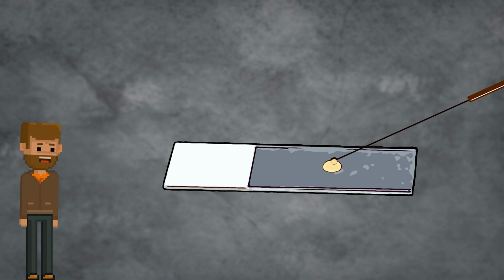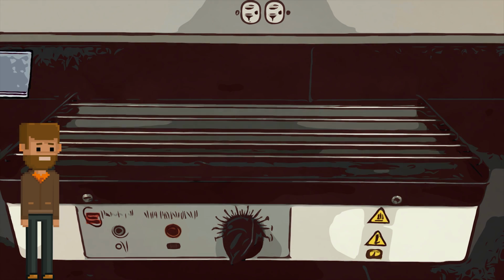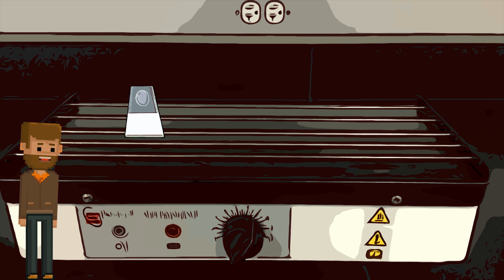It might take a little practice, but you don't want to put a huge glob of bacteria, and you also want to avoid not putting enough bacteria. Once you've transferred the bacteria onto the slide, you'll want to try and spread them around evenly so that they're easy to view under the microscope. Next, you're going to let the slide air dry. Make sure you don't skip this step. If you want to speed up the process a little bit, you can use one of the slide drying benches.